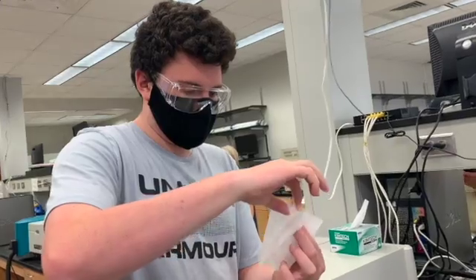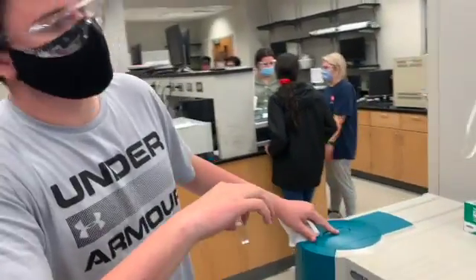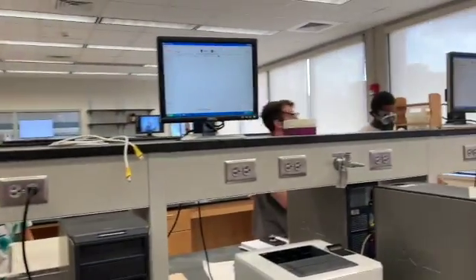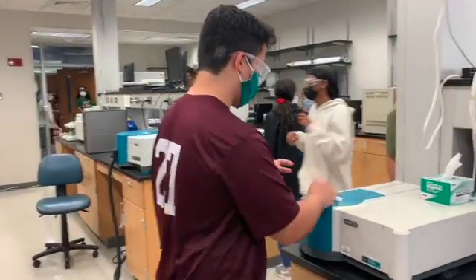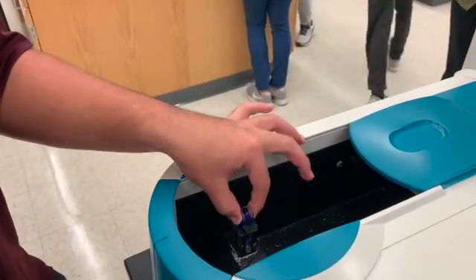We open the scan feature of the spectrophotometer, clean both sides of the blank cuvette, enter it into the spectrophotometer and then zero it. Using our most concentrated copper amine solution, we use the scan feature on the spectrophotometer to get the absorbances for all wavelengths for copper amine.